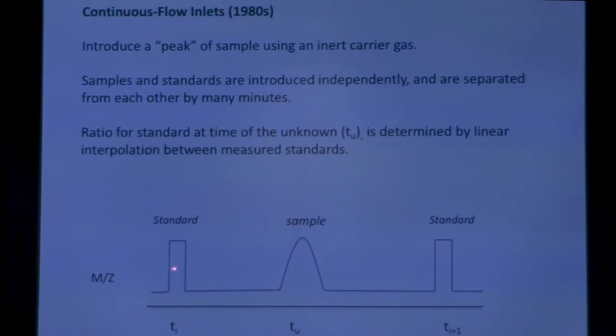And so in order to do that, we take the standard value here that we measure and the standard value there, and we interpolate across that time period. The software draws for you a straight line between those two values, and wherever your sample is, it picks the value of your standard at that time, and then it compares your sample to that.